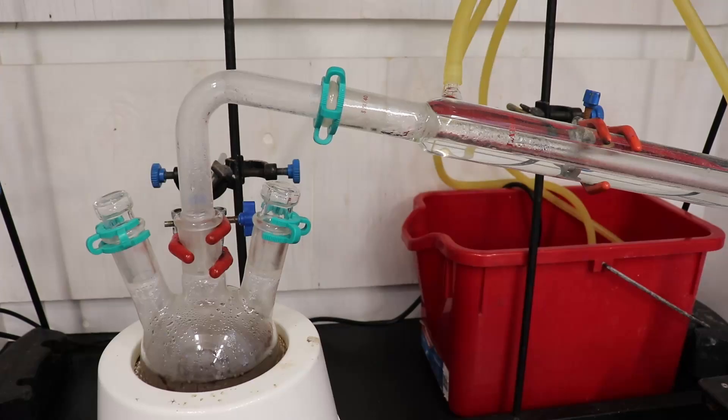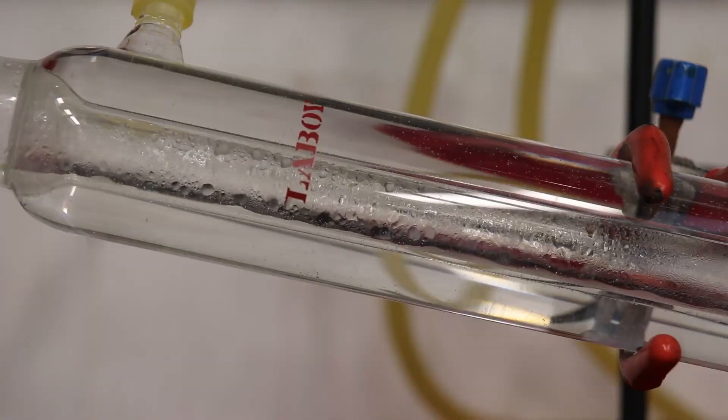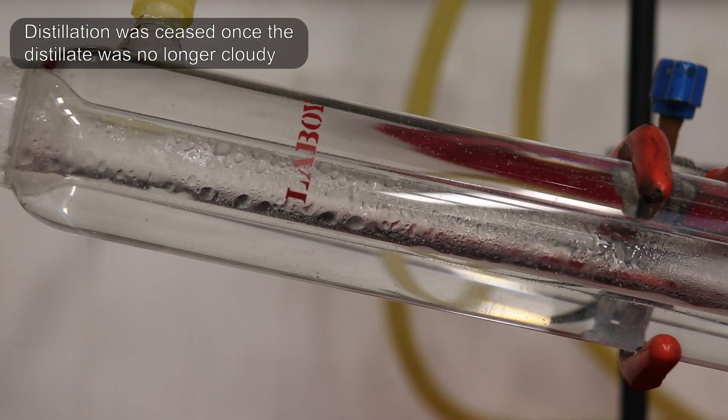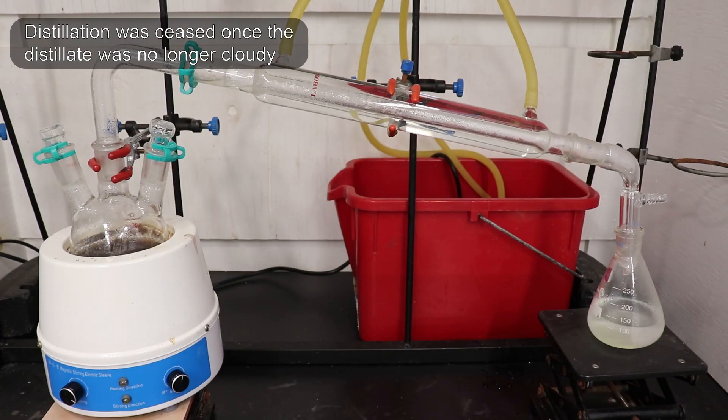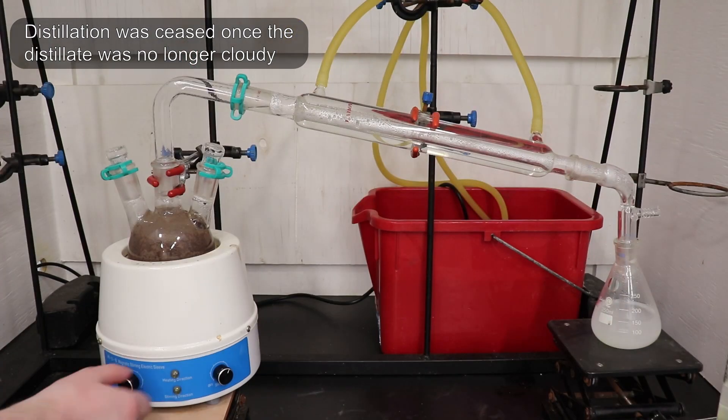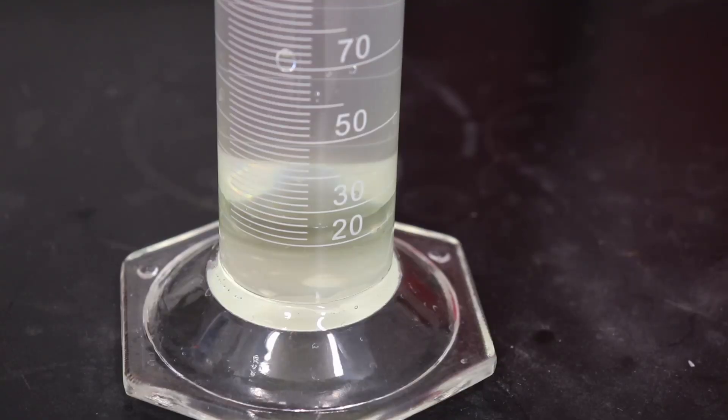I then set up for simple distillation and steam distilled the mixture. I ended up collecting 250 ml of distillate in total, with about 25 ml of a lower organic layer consisting of the recovered nitrobenzene and 225 ml of water.